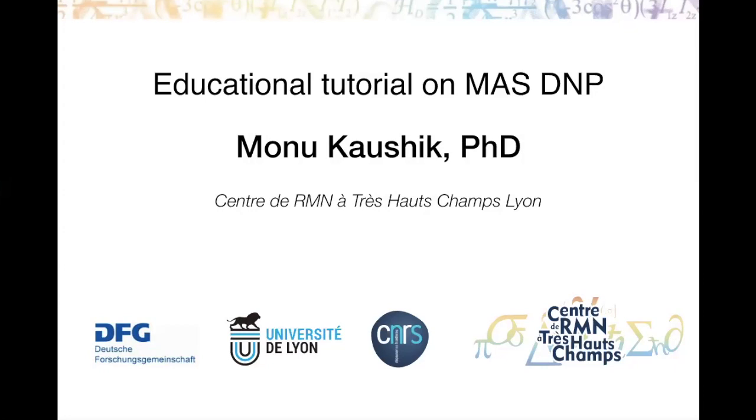So I tried to put some slides together and explain about basic DNP mechanisms, and I tried to include some recent work from 2020, in fact. So today I'm going to talk about hyperpolarization methods, mostly in the context of magic angle spinning solid state NMR enhanced by DNP.